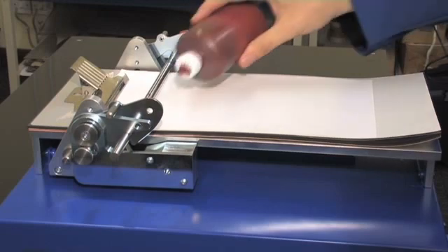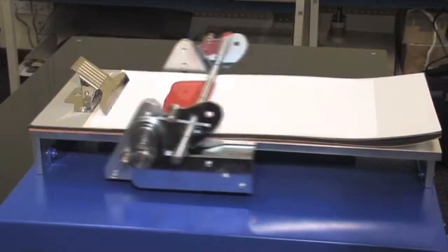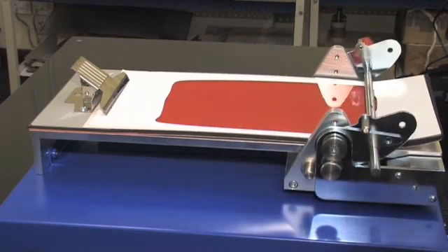Where speed and reliability are essential, the automated K-Control Coater provides quick, accurate, and repeatable samples with any fluid onto most substrates.